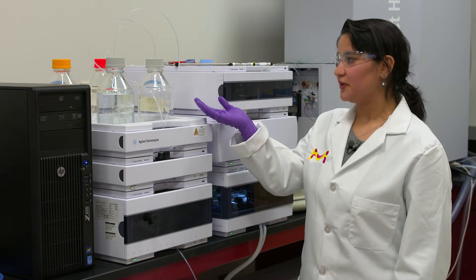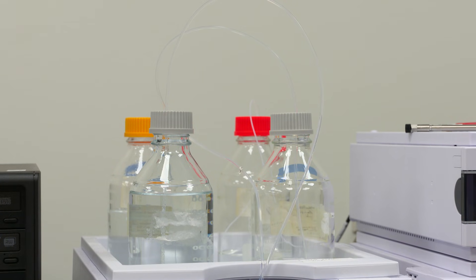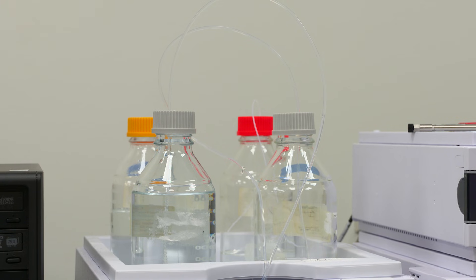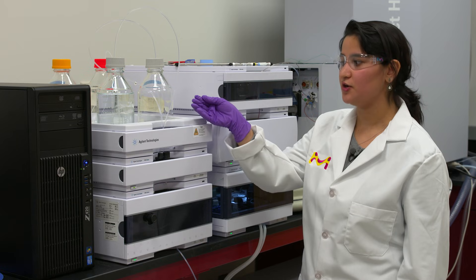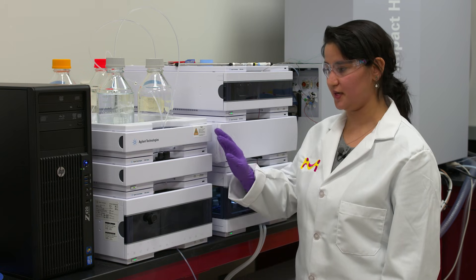Once your mobile phase is filtered, attach it to the appropriate mobile phase tubing line and make sure your tubing lines are flushed into a waste container so it does not carry any carry overs that can cause contamination to your system. The next step is to purge your HPLC.